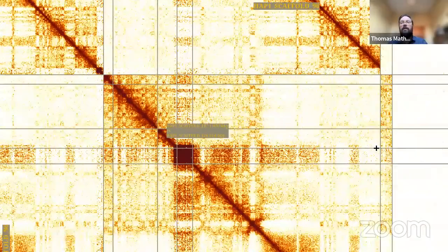So we grab this, move it to the end, likely links like that, and we can add in content. I'm just going to finish moving the two haplotypes across, and then we'll start doing the actual curation of individual chromosomes.